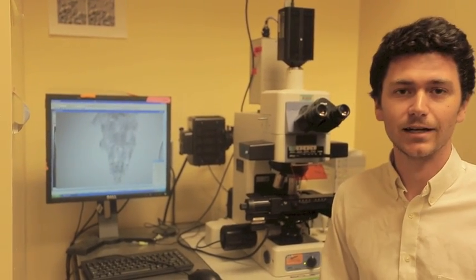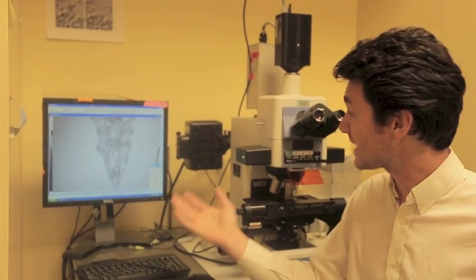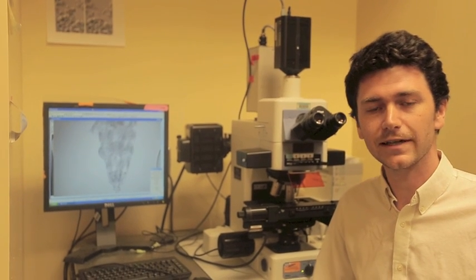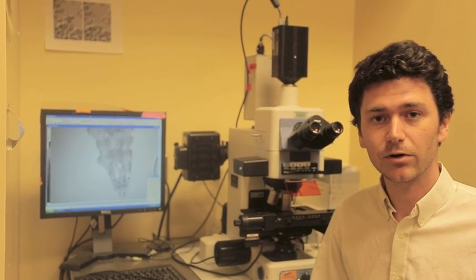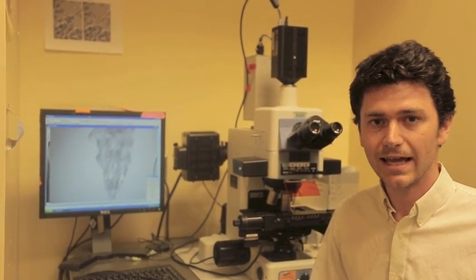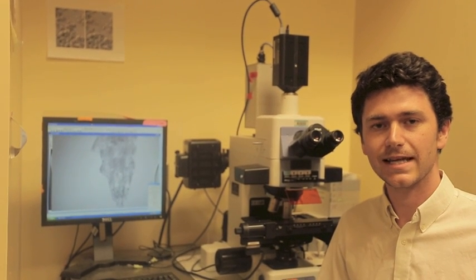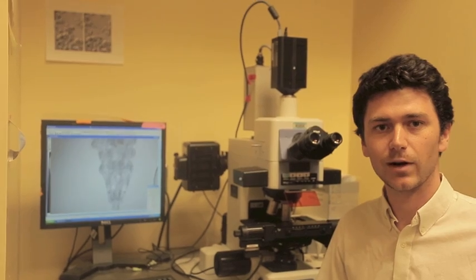Oh, excuse me, I didn't see you there. I was busy looking at this fascinating tardigrade I found in my backyard. Have you ever wanted to find your own tardigrades? If the answer is yes, then please join me, Dr. Thomas Boothby, and tardigrade hunting expert Jenny Hepbert in this instructional video where we show you the equipment and techniques you'll need to find your own wild tardigrades.